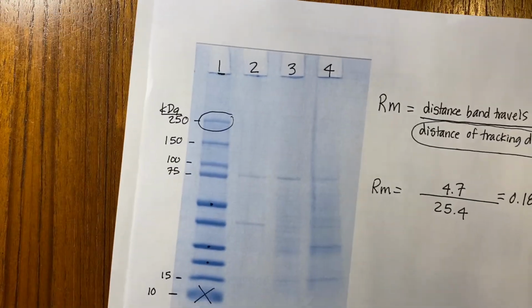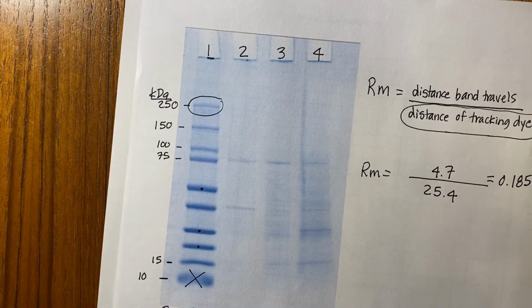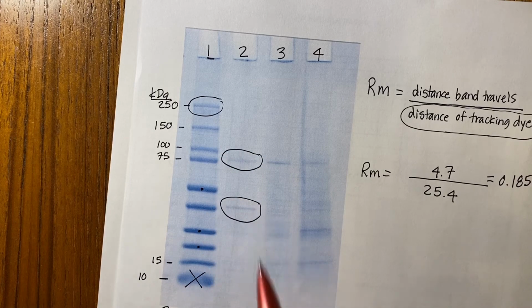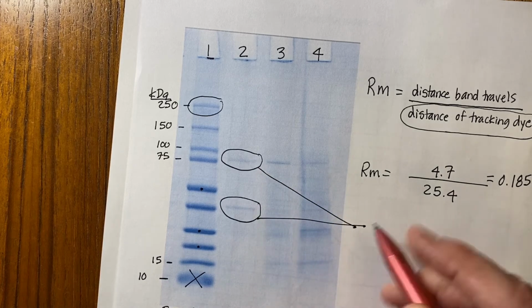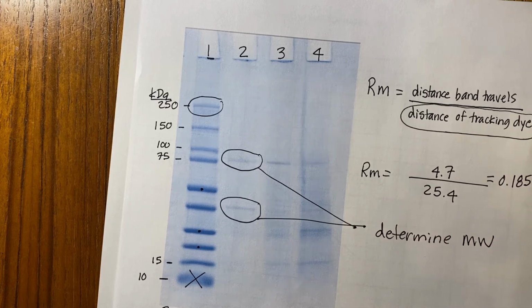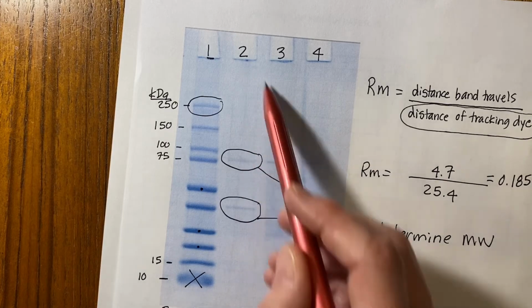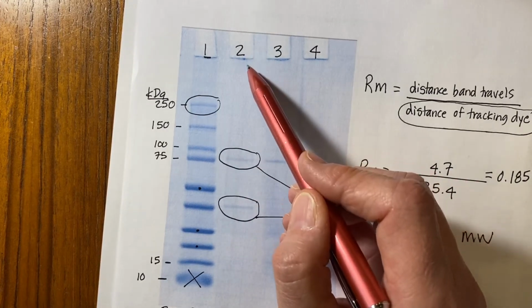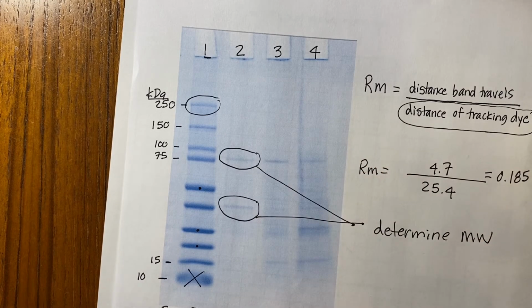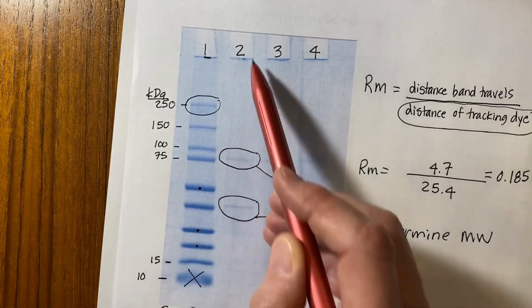So going back to our gel, what you have to do in terms of calculating is determine the molecular weights of the bands in your sephadex fraction, or the most purified fraction on the gel, and that would be lane 2. So you have 2 bands there that you have to determine the molecular weight of. So measure how far they travel, so it'll be 2 measurements, and divide them by the value of the entire lane. So go from the bottom of the well down to the bottom of the picture for your distance of the tracking dye, and then divide that into how far each of these bands migrate.